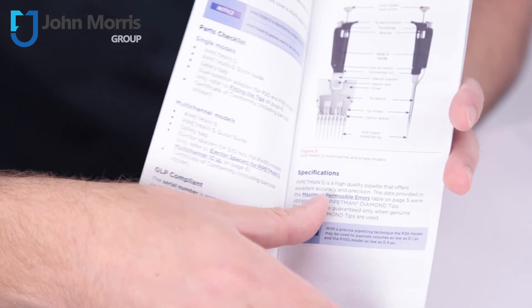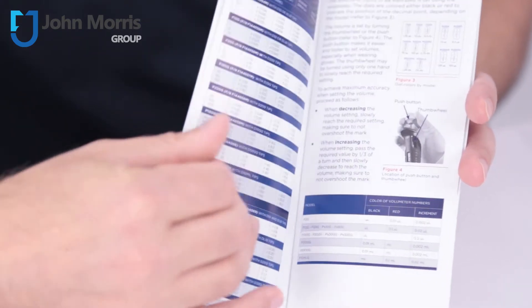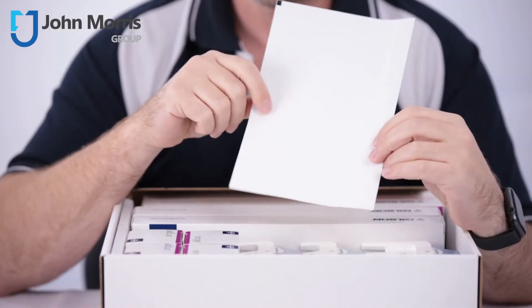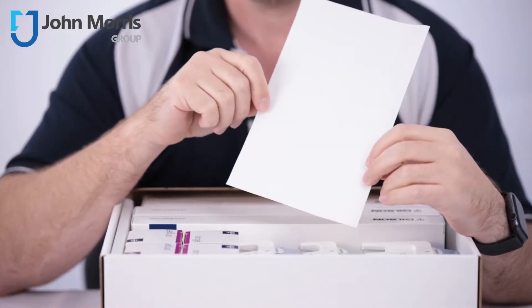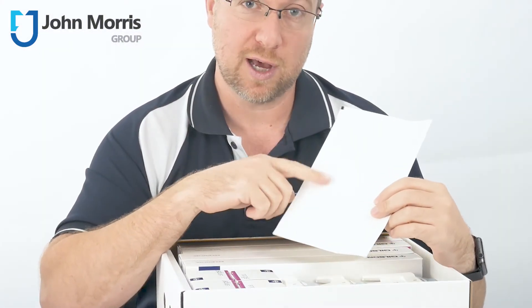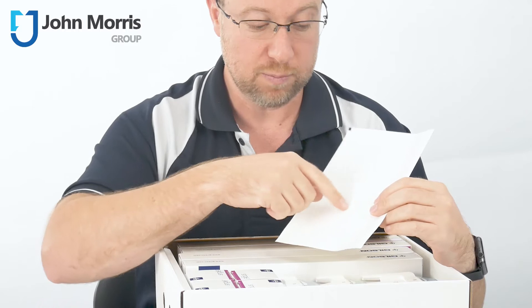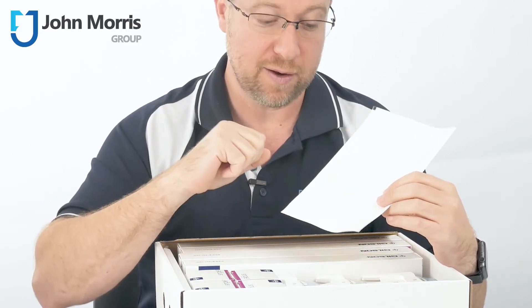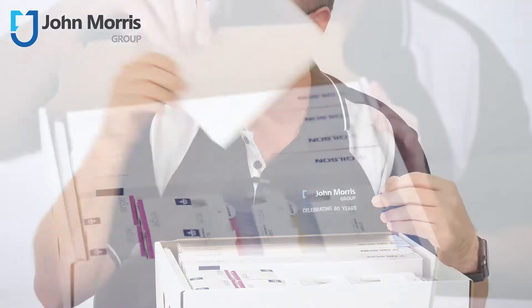You've got a quick guide here, just in case you're not the kind of person who likes to read long manuals. You've also got this handy label maker which will fit into most standard laser printers, and what that enables you to do is customize your pipettes. You can print names or designs on these little labels and then stick them onto your pipette for easy identification in the laboratory.